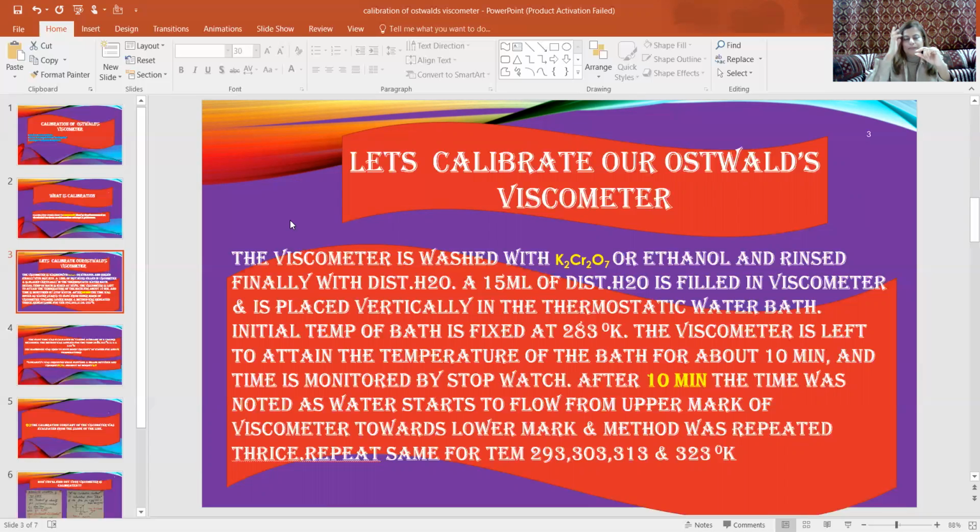And then you are going to do the different calculations. You're going to find out different things after measuring the flow time, because every solvent flows with a different speed; it has got different viscosity. It's never the case that the viscosities are similar. They are almost always different, right? The flow is different. When you are flowing water on the floor, you will see a different speed of its flow, right?